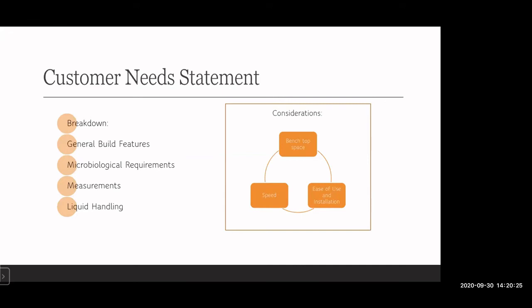I did say, I think, 6.5 minutes for 96 wells. That was just based off the dispensing rate I put in your liquid handling section. And that was just so, once again, we want you to try to do it as fast as possible without causing any splash or volatility from any of the compounds getting out from the wells.